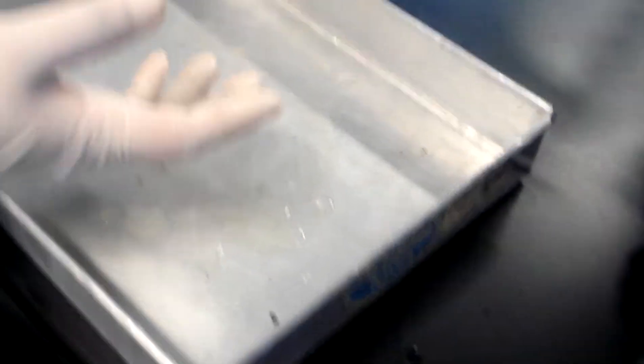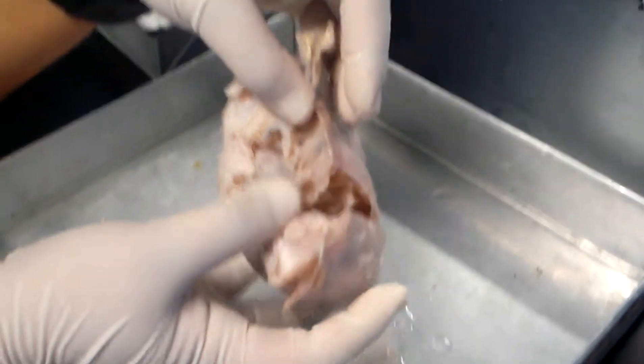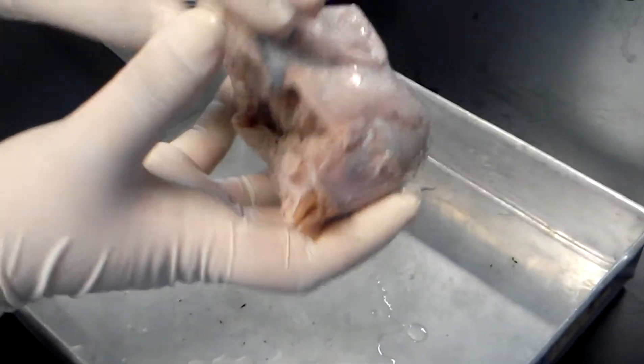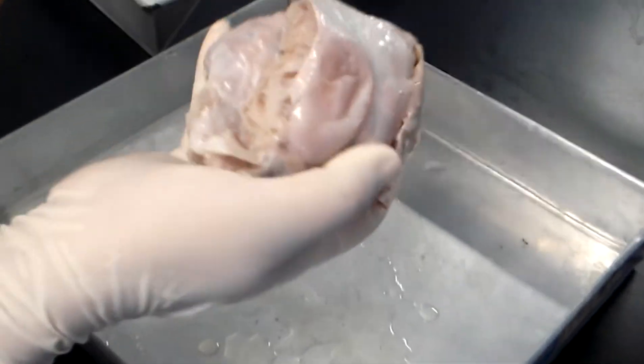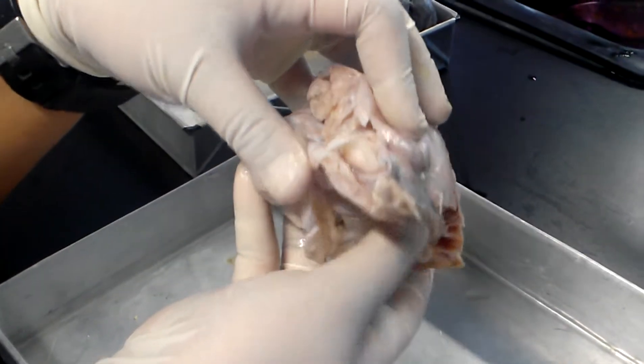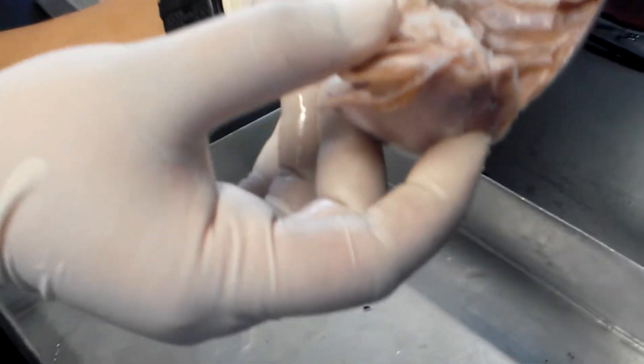This is like 2 liters. This is disgusting. This is another sample of your mucinous or serous cyst. You'll see, if this is intact, this is the large ovary. And when you open it, you will appreciate a lot of locules inside.